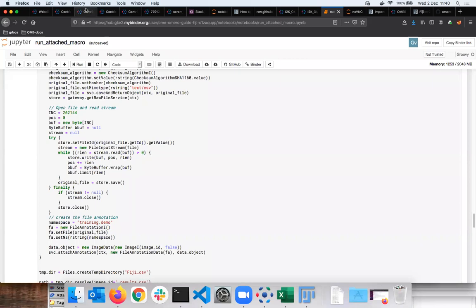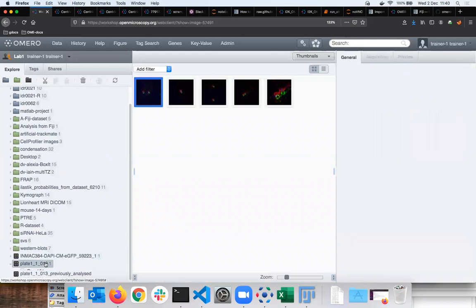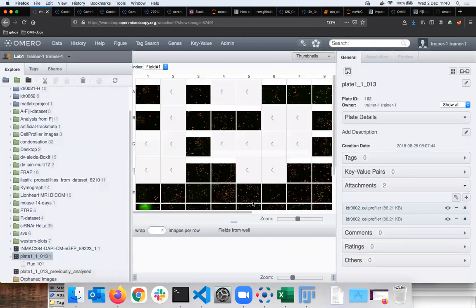Okay, so let's just storm through CellProfiler. CellProfiler is a very popular image analysis tool with a great power, which is used very often on high content screening data, but also on other images, why not? We will show the power of CellProfiler on this data, which are also coming from IDR.